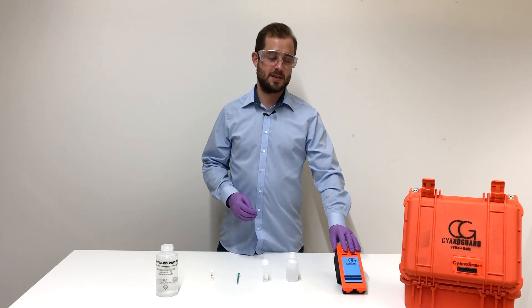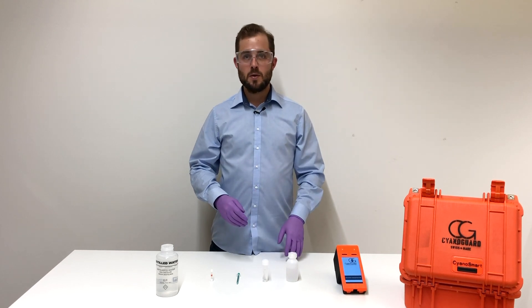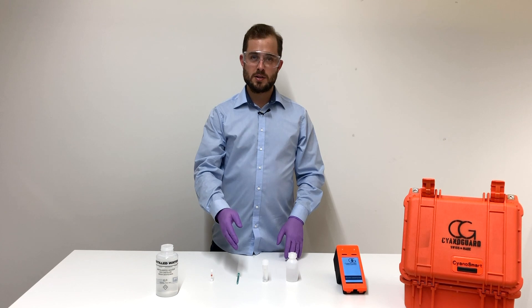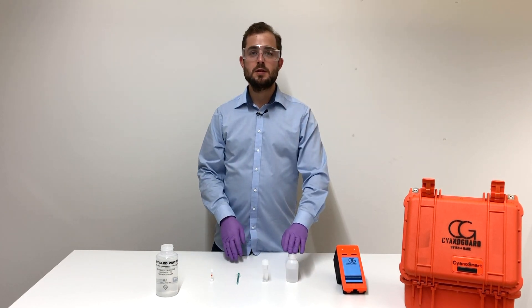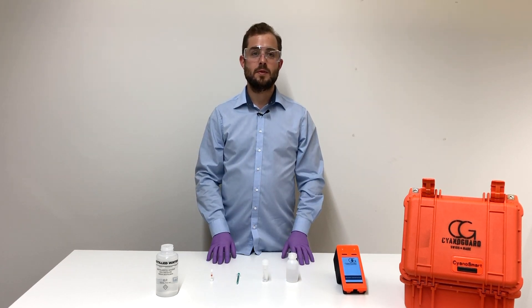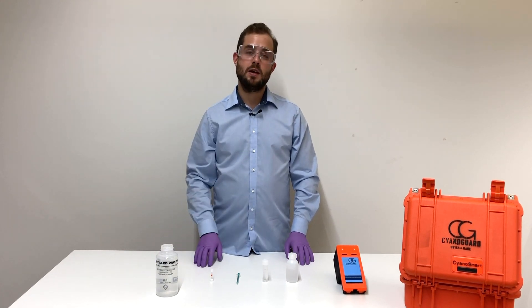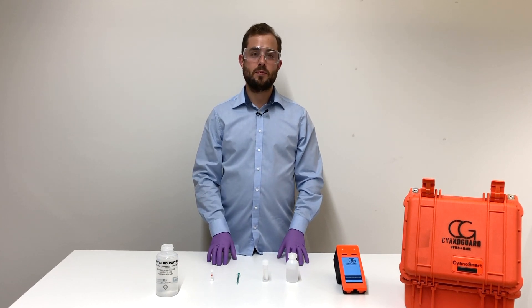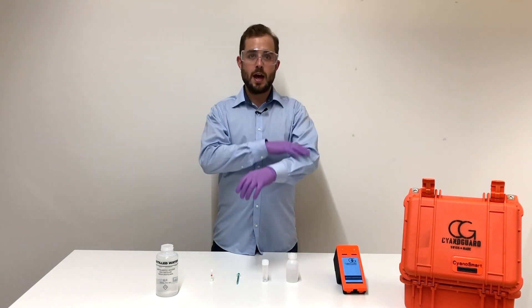First, make sure your analyzer is charged. To make a measurement we need a test cartridge, a syringe, a test vial, and of course your sample to be measured. Also make sure you have some clean water and your personal protective equipment ready. When working with cyanide-containing solutions you should always wear gloves, safety glasses, and long clothing.